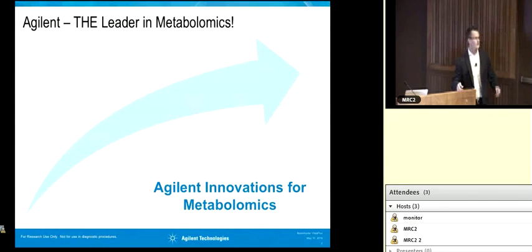So at this point, I'm going to give you kind of a more technical overview of the workflow. We'll spend a little bit of time on algorithmically how we're extracting the isotopologs. And at this point, I know there's going to be some guys and gals in the audience that are going to have a couple of questions. So I would say go ahead and spit them out for the algorithms, and the odds are I won't be able to answer them anyway. So, so I've alluded to this already.